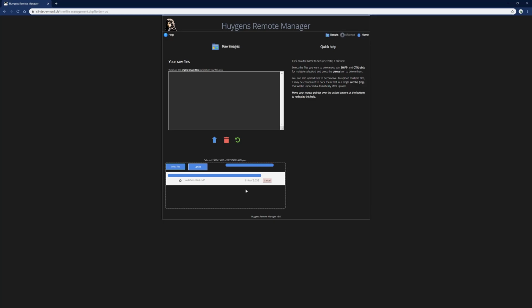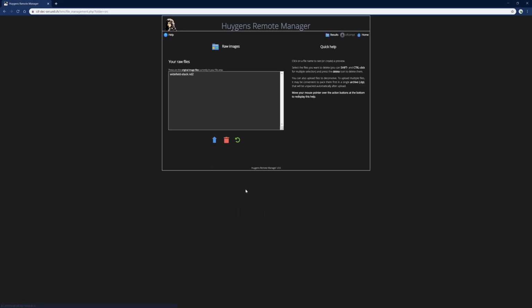So make sure that once you have uploaded your files, processed them, and got back your results, you store everything safely elsewhere than on this server.